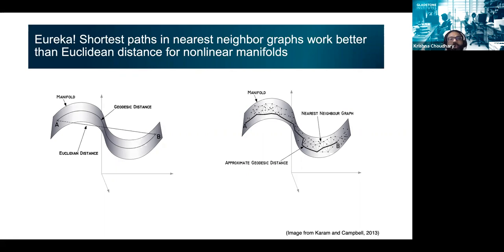t-SNE and UMAP. So as I mentioned earlier, PCA was invented at the turn of the 20th century, and people did realize, in the middle of the 20th century or sometime, that there is also this analogous question of nonlinear dimensionality reduction. But there was no solution until the early 2000s. I think in 2001, two solutions were proposed and published simultaneously back to back in Science. One was called ISOMAP, and that is the approach which I have in the illustration here.